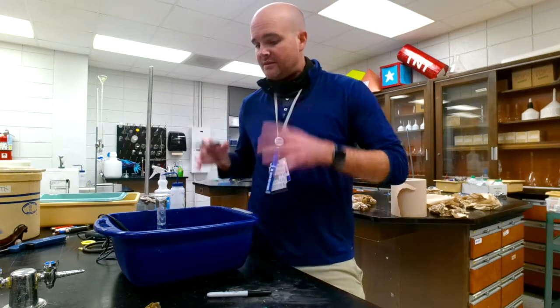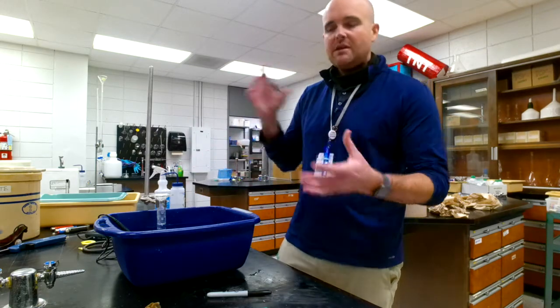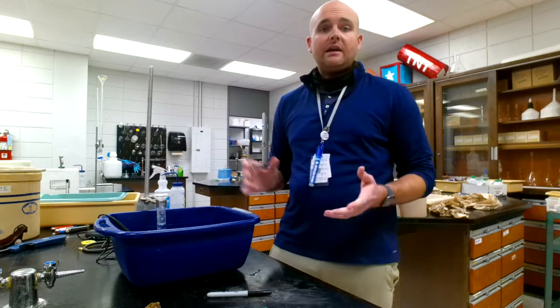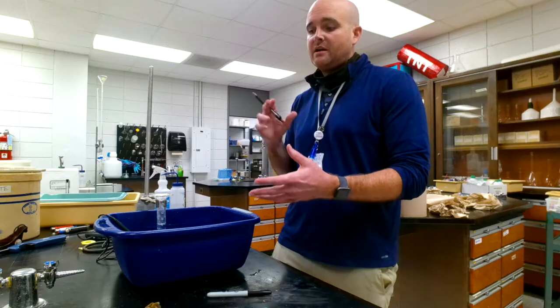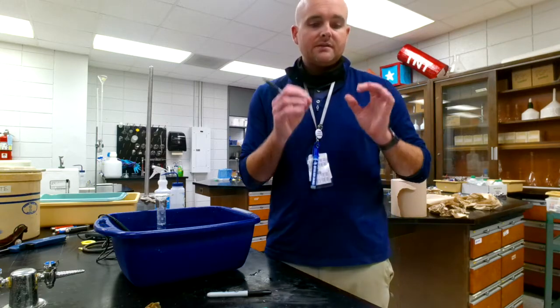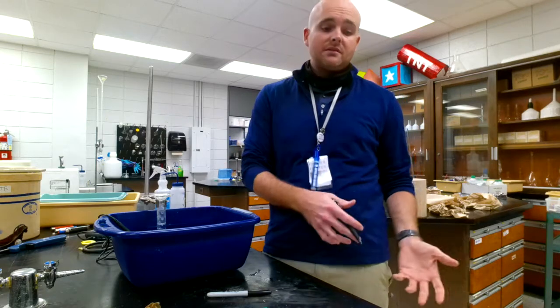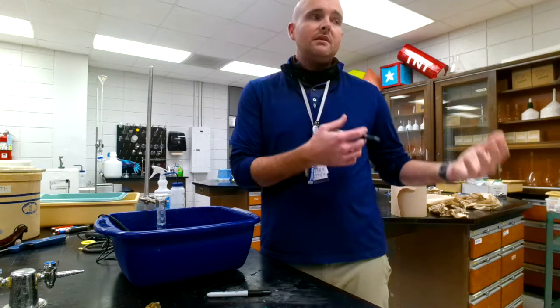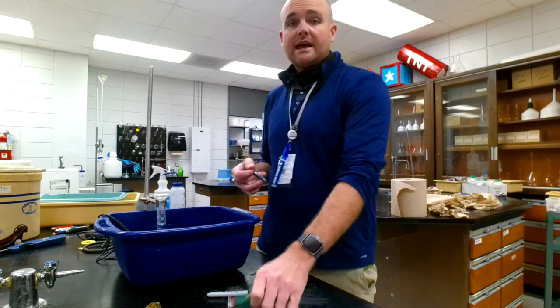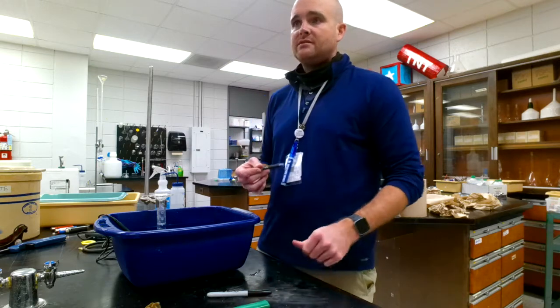Another thing you should think about is that this experiment has lots of possibilities for manipulation for your own IA. You could do an IA off of this experiment just by focusing on one specific part and trying to see how much of an impact it has on your uncertainty. You could try it with different gases. Maybe you could produce different gases. Find a different way to do that.